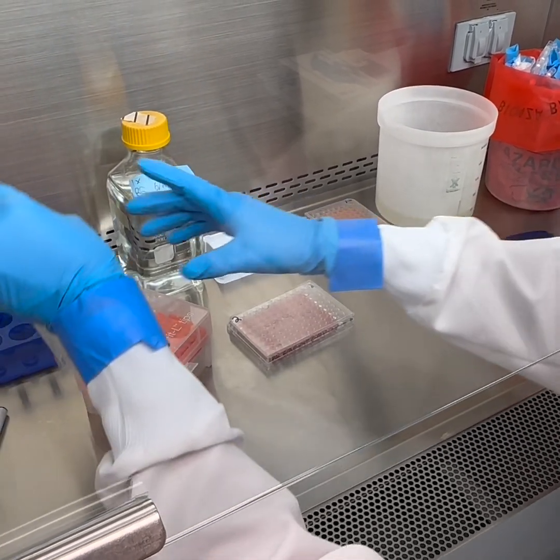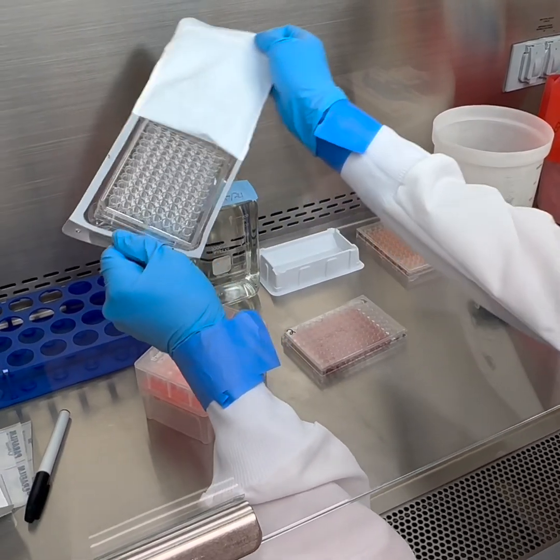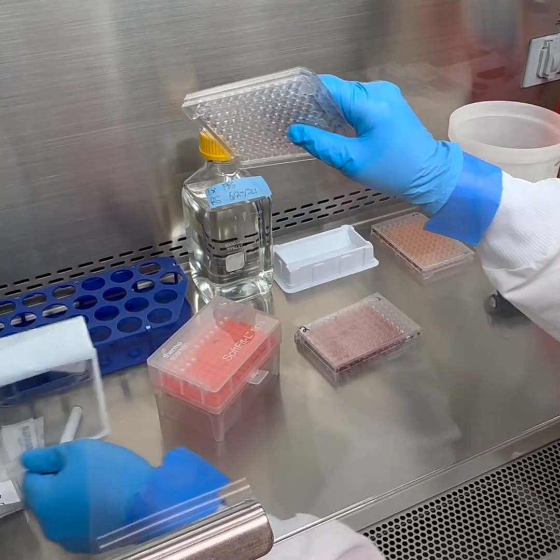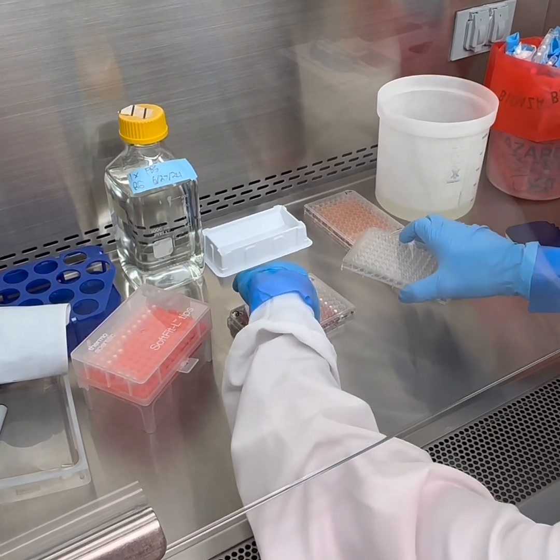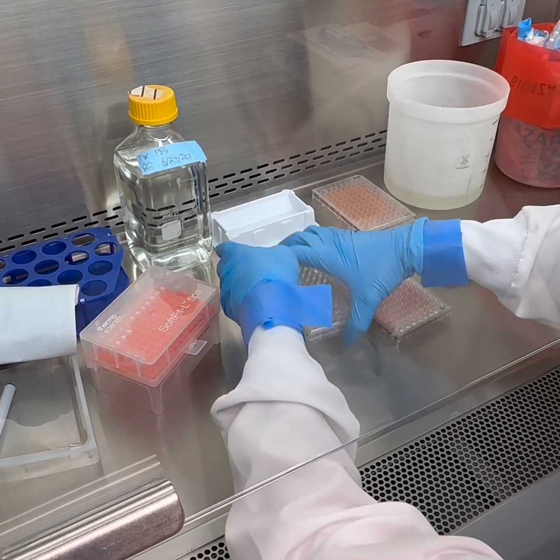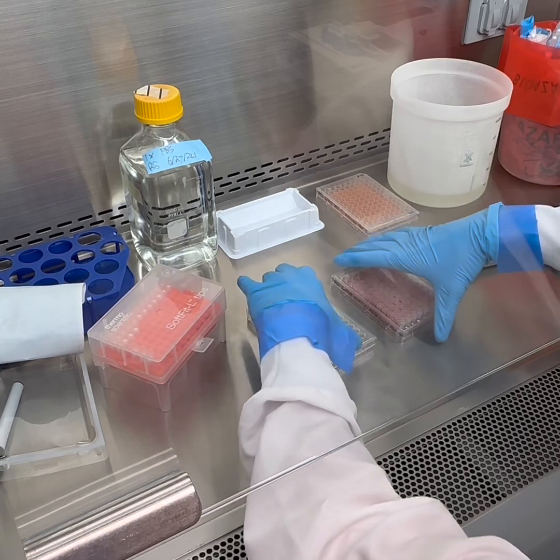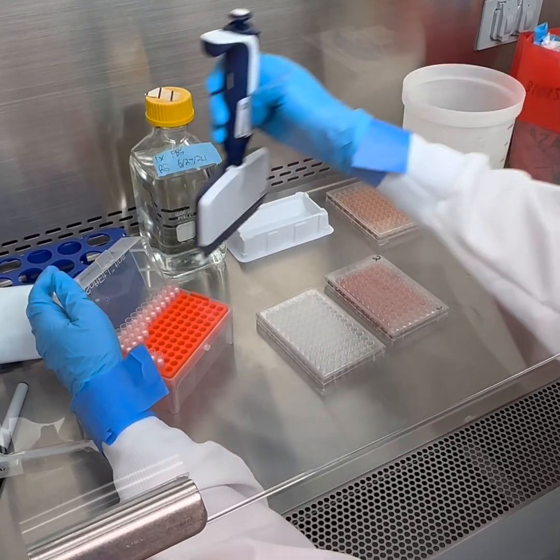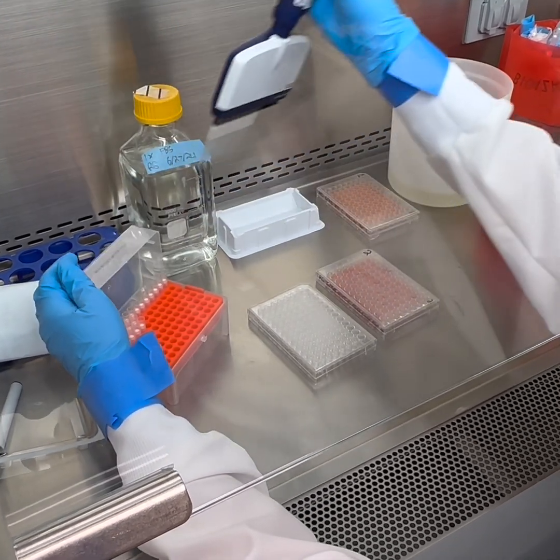So you're going to get a clean plate, and you're just going to transfer the supernatant. Okay, so it's going to be 75 to 80 microliters from each well into your new plate, and this is the plate that we're going to read, the one without the biofilms. And that's going to measure metabolic activity, which directly correlates with biofilm maturity.